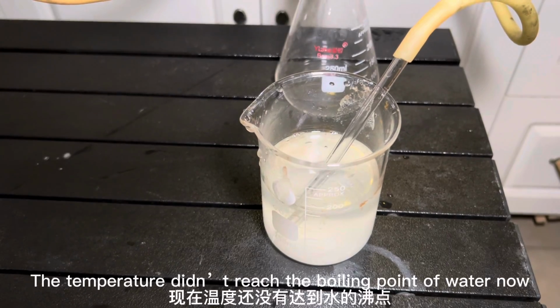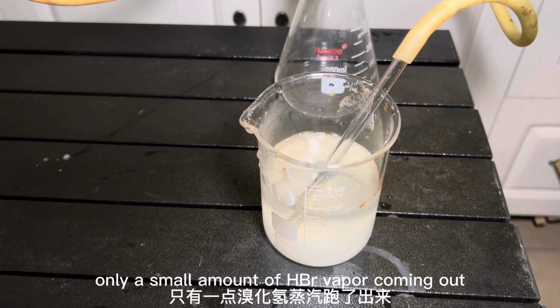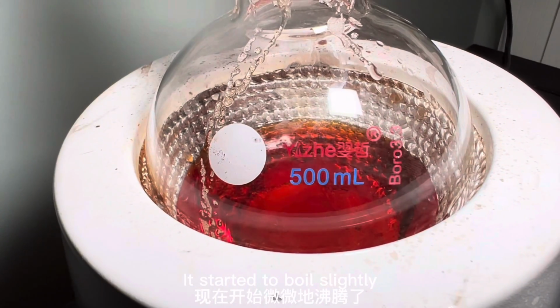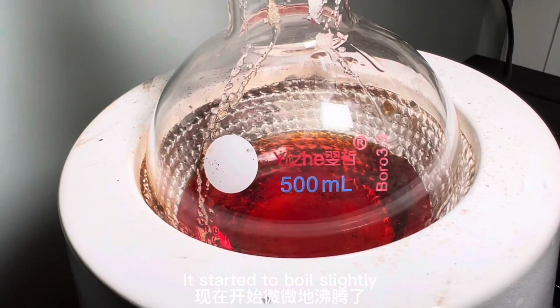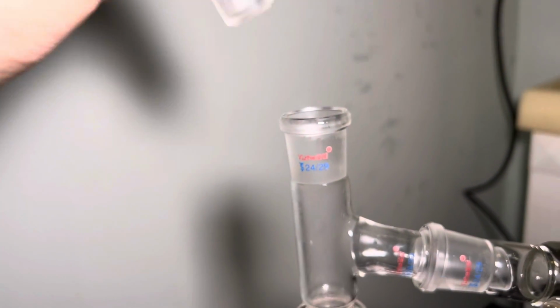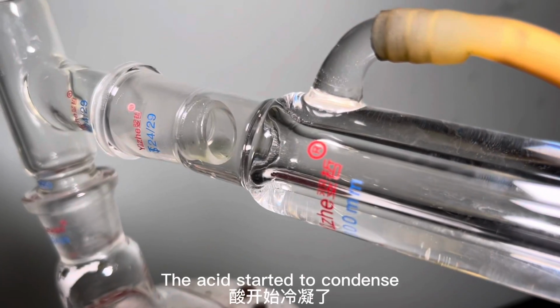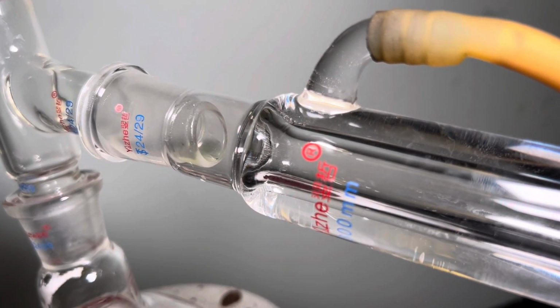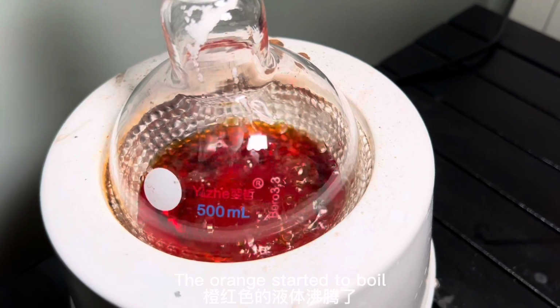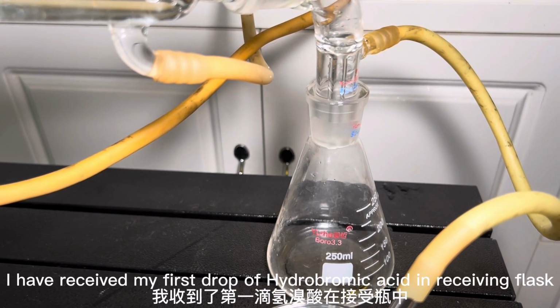The temperature hasn't reached the boiling point of water yet. At that time, only a small amount of hydrogen bromide vapor comes out. It started to boil slightly. There's a small amount of hydrogen bromide vapor in the apparatus. The acid started to condense. The orange liquid starts to boil. I have received my first drop of hydrobromic acid in the receiving flask.